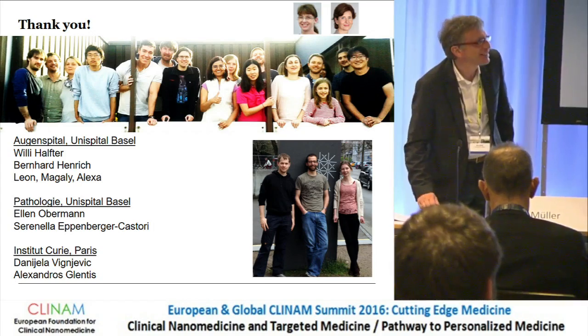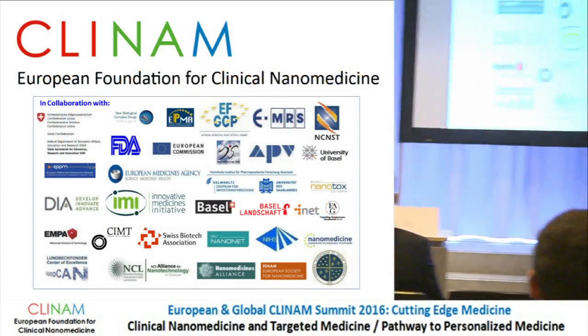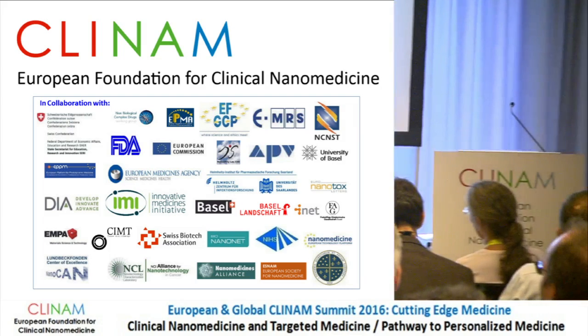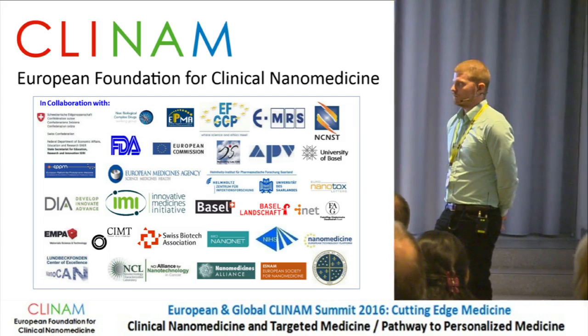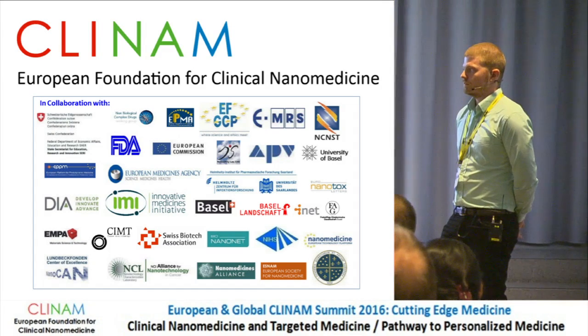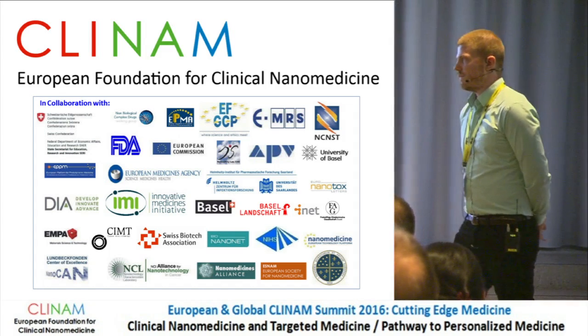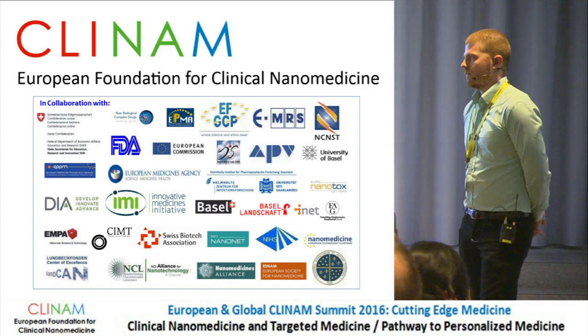Okay, maybe I can ask a question. What about the cantilevers? I think they play a very important role. So the shape of a tip, as you have shown, might not work because the cells don't like these very sharp tips, I think. And can you comment on how to prepare the tips and where you buy the tips?